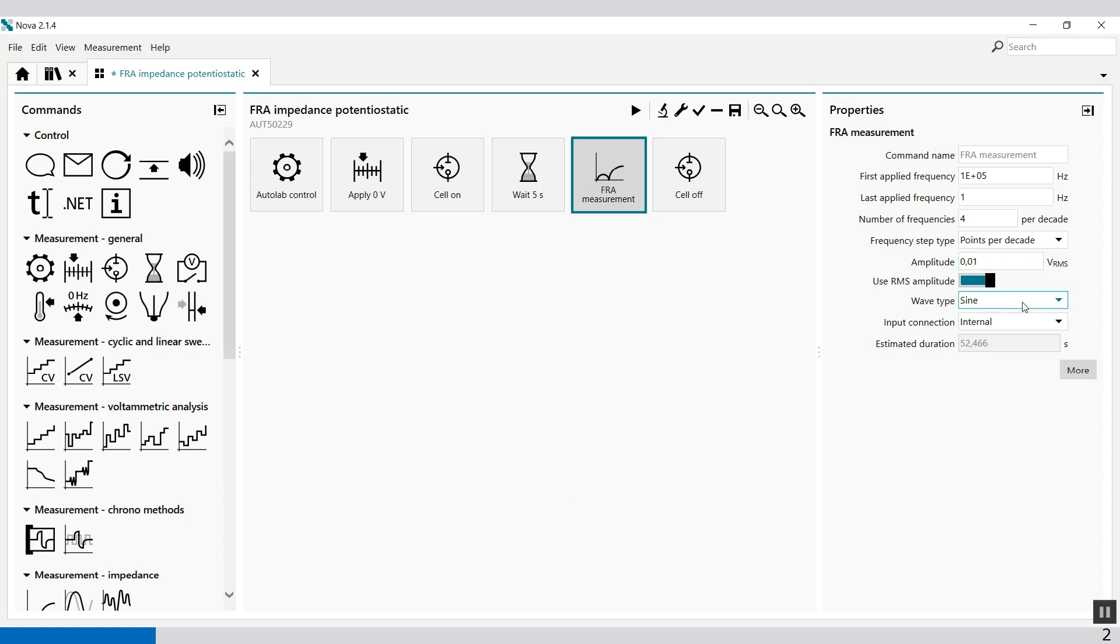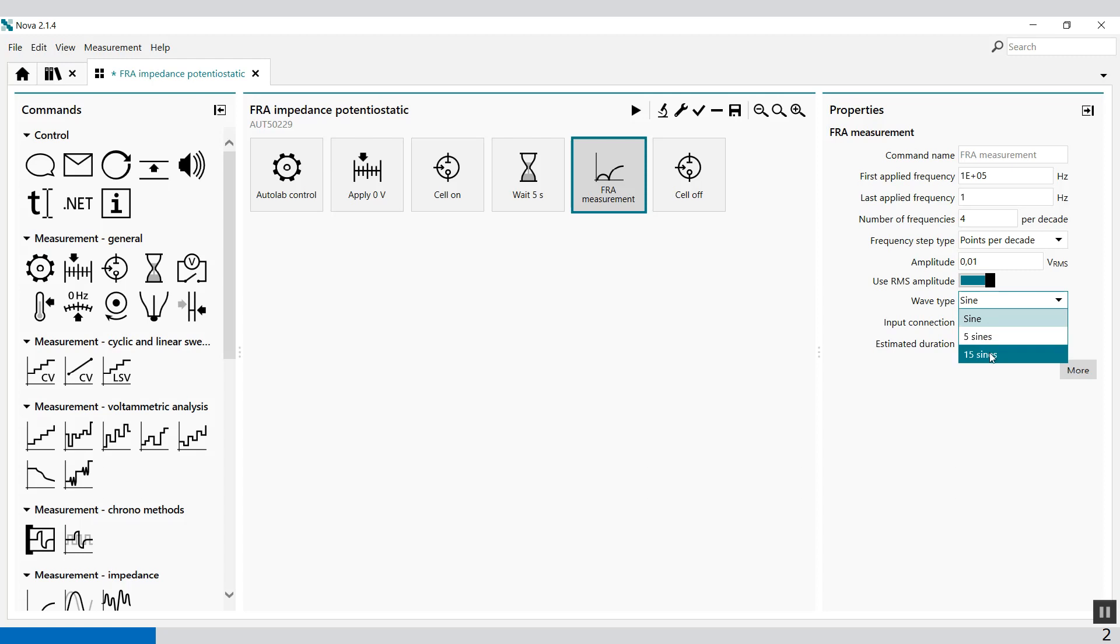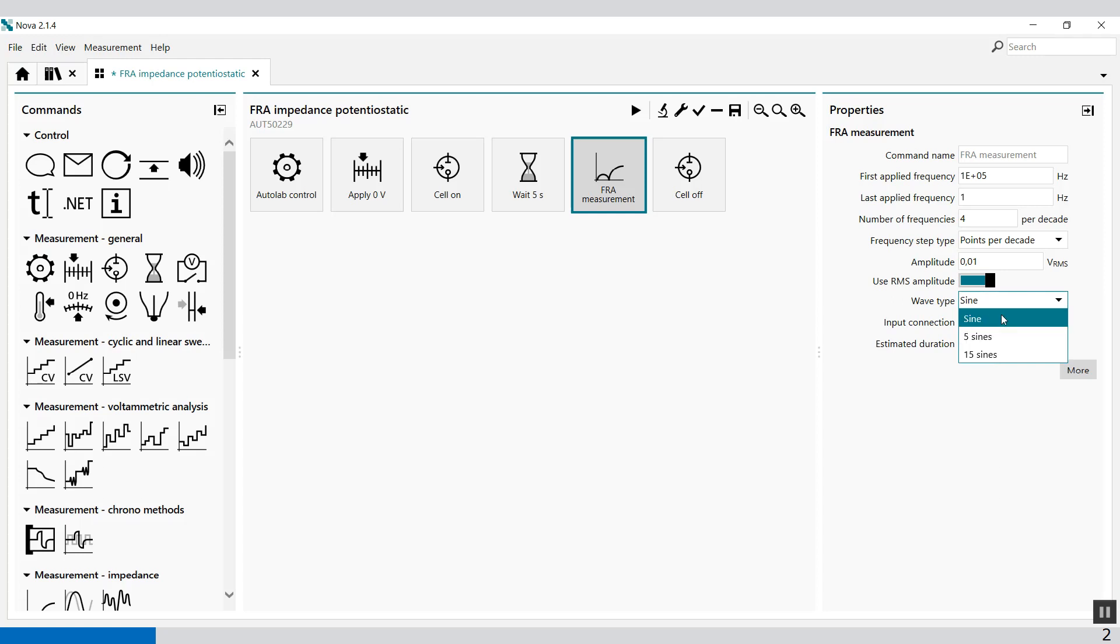Then we have the wave type. You can set single sine. Normally it's set to single sine, but for lower frequencies you can also select 5 sines or 15 sines. There will be, on a base frequency, superimposed 5 additional frequencies or 15 additional frequencies depending on what you select. But normally you apply one frequency at a time.